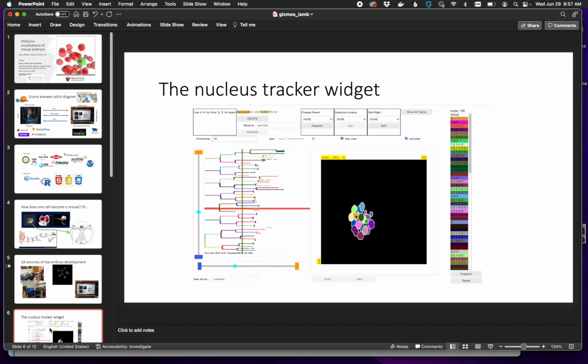Some of the basic questions for embryonic development are: how does the single-cell egg transform itself into many cells? How do the cells of the embryo move and divide over time? When do the cells of the embryo divide into daughters, and what are the fates of the daughter cells and their descendants? To explore these facets, we must determine which components of the image volumes for the timestamps correspond to the same physical cell of the embryo. We must also identify division events and mother-daughter relationships.